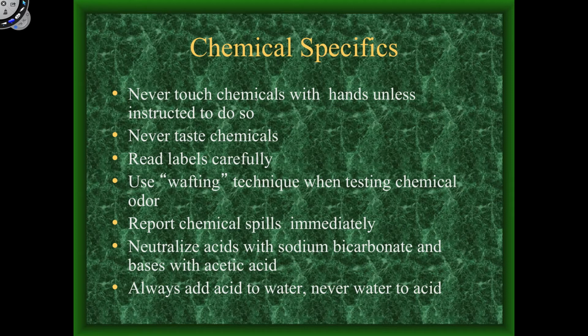The old example I used to give is, if you see a beaker and it looks like it has water in it, a lot of chemicals look like water. And you don't want to bring something like hydrochloric acid, which looks identical to water in a beaker, into your mouth. So obviously, don't taste chemicals. That should be pretty easy to understand.